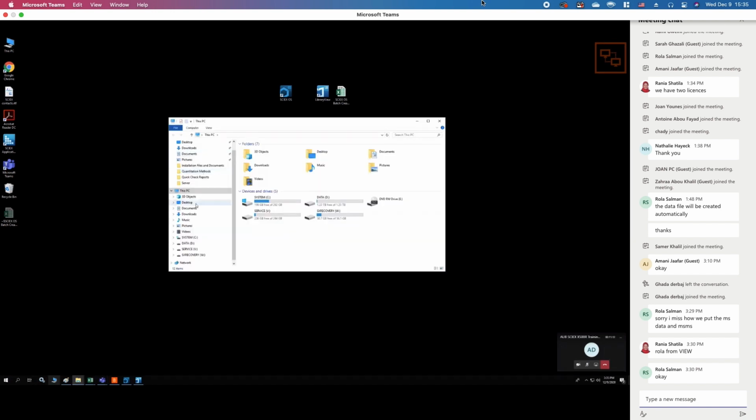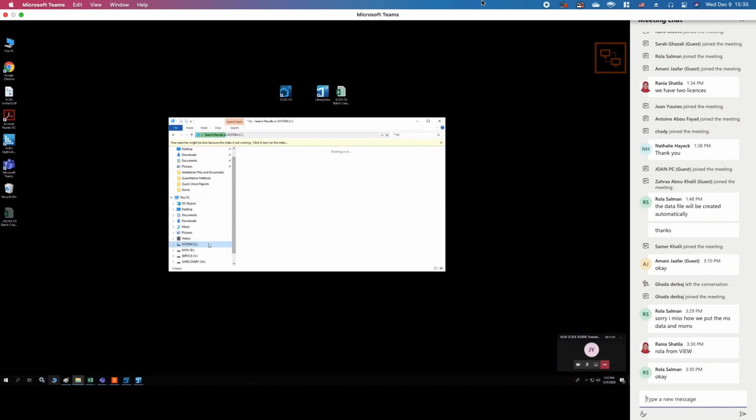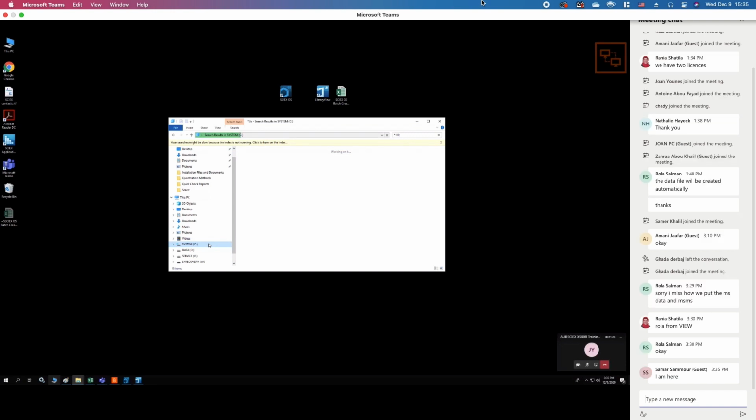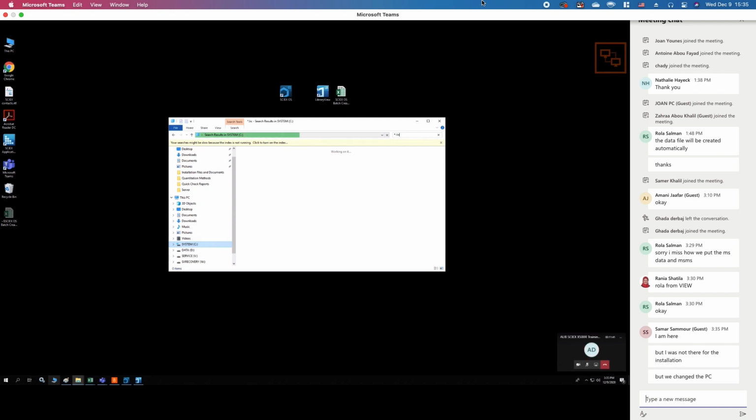Samar, are you there? Can you give me some advice on whether they installed the license or not? Hi, Alex. Hello. Okay, we installed the license. It was installed, but I don't know how come now it's not working. Okay, well, the IT service was working? You're sure it was working? At least in the library view, we could see it. Yeah, okay. So probably the service just stopped, maybe if the computer hasn't been restarted in a while.